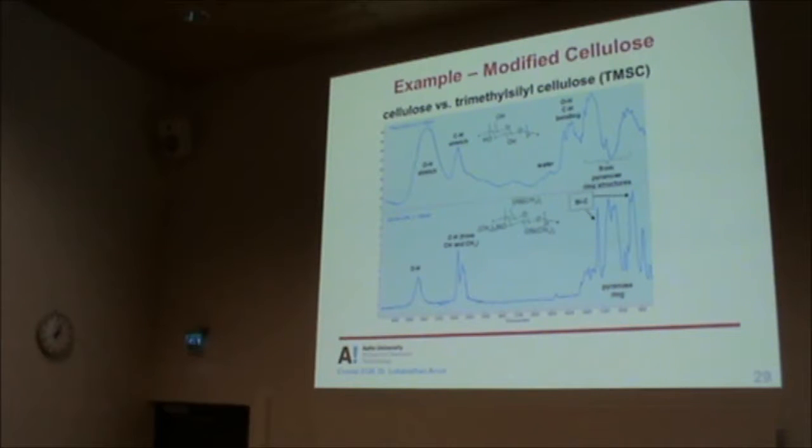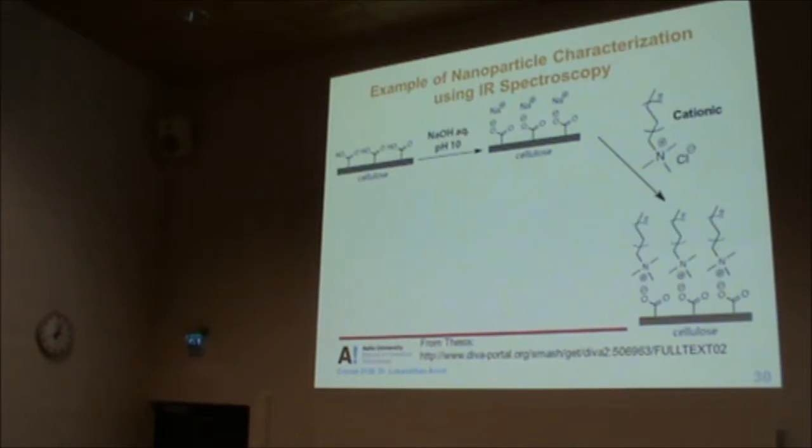So now, if you look at the spectrum, you have to find there's a new element. That means there's going to be new bonds around it. So now you have an SiC bond turning up, which is due to the presence of this, and OSi that also will be there somewhere here. So this is a very quick example of how, if you do a very simple modification, if there's a change in bonding environment, we can detect that.